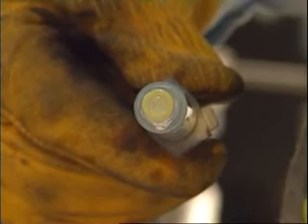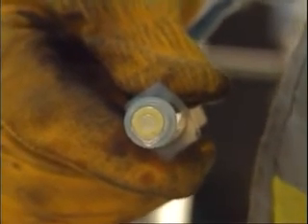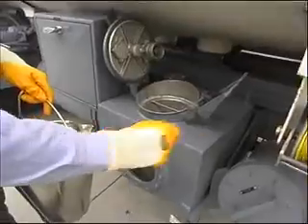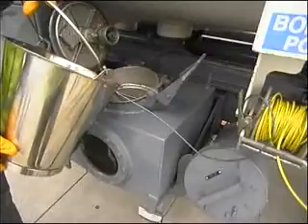Step 7: If there is no colour change, the result is acceptable. Empty the contents of the syringe back into the sample container and return to the recovery tank. Complete the documentation.